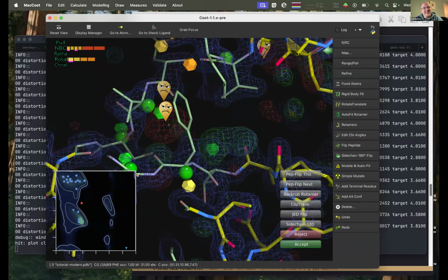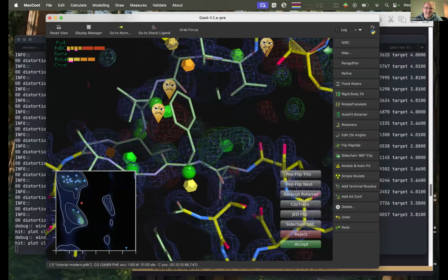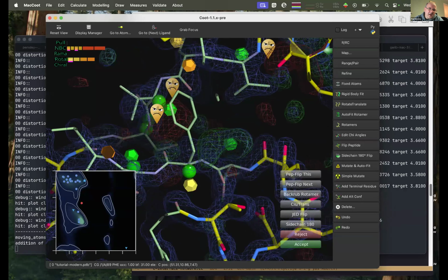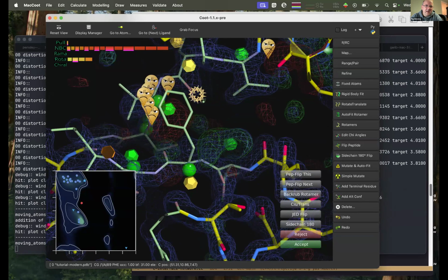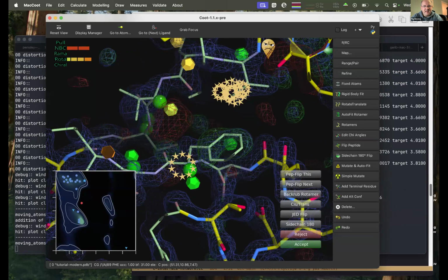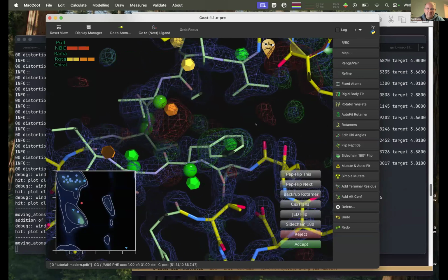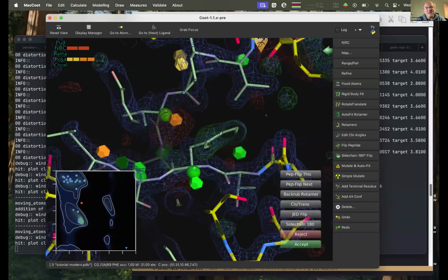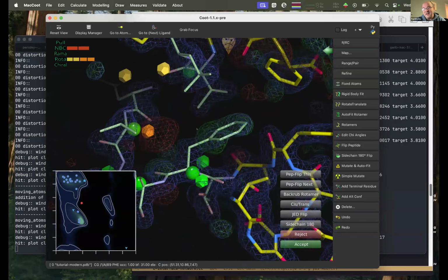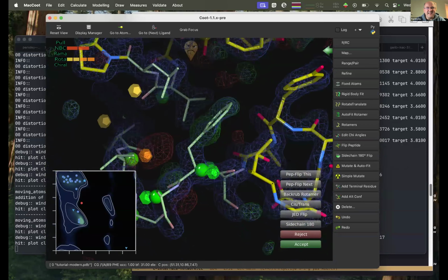are unhappy, right? The idea is that what we're looking at here is unhappy interactions between your protein, and as I pull on the atoms, then they disappear. I kind of push it in, they get unhappy, and I pull it away, and then they, like little balloons, disappear and pop. If you turn the sound on, they go pop, pop, pop. It's quite fun. Maybe not for your colleagues, but I find it fun. There is a way of turning the sounds off. You're not forced to listen to the sounds.